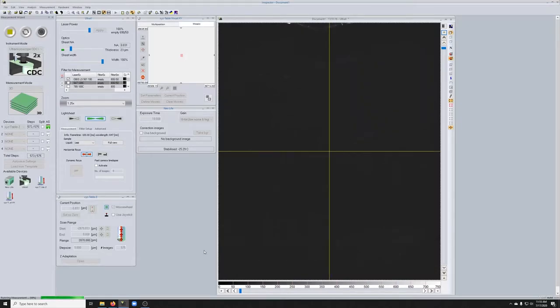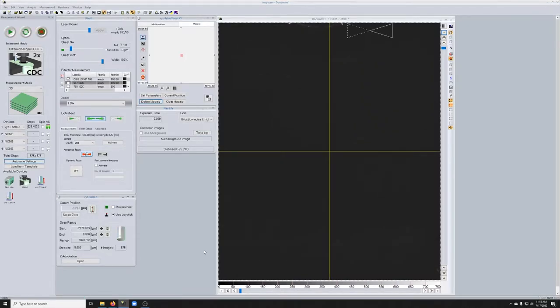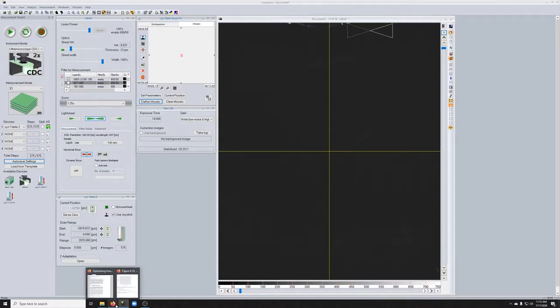So you can see it's about to conclude. It finished. Let's take a look at where the data ended up and what it looks like as far as structure.